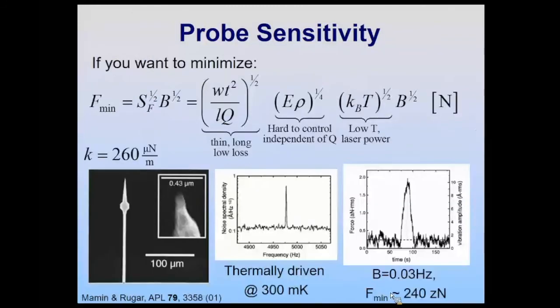So to give an example of how good you can get with this, Dan Rugar's group has been working on MRFM, magnetic resonance force microscopy, and so they want to measure the impact of single spins and single spin flips on the force between that spin buried in the material and the tip, the cantilever, which is above it. You imagine that's a very small force, and so they had to really perfect this technique.